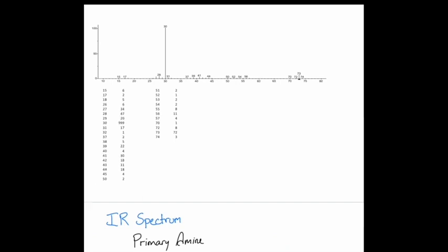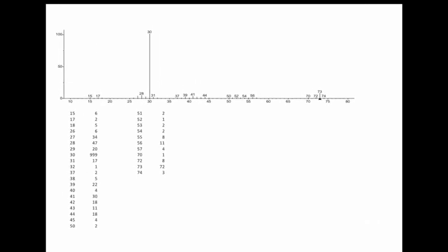Not often do you look at a mass spec and get immediate functional group information, but there are a few exceptions. And one of those is an odd number for your molecular ion peak. Every other functional group that you were to analyze would give you an even number for your molecular ion peak, except for amines. All right, and so that in and of itself is a helpful piece of information here. I already knew that from my IR, but it just checks out here.